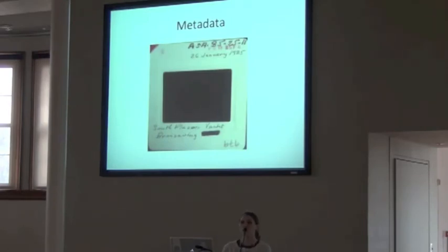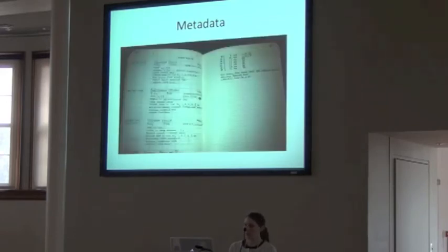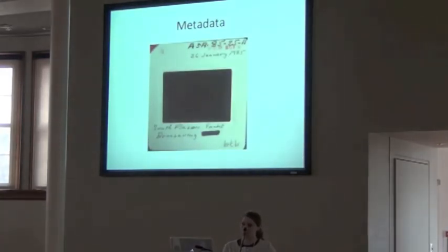Next. So that is essentially the electronic organization. But the metadata has really been the biggest problem. You can see that there are handwritten notes on the slides, and these notes relate to the day that someone was out, possibly to the field notebook, which you can see here. And we just continue to sort of add things. In the bottom right-hand corner, you can see a handwritten number in pencil, that's the unique identifying number that was written on the slide.